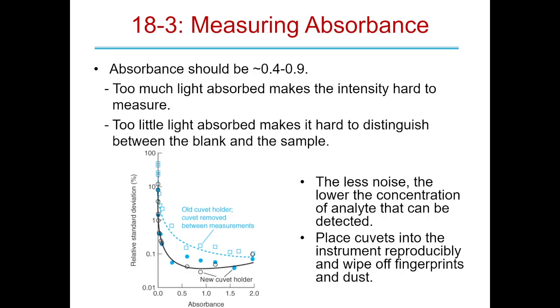Those things are just terrible spectrometers. Absolutely awful. If you were to take the same sample, you'll actually see a change in the 0.01 area or 0.008-ish area. And they'll bounce around, so that has a lot of noise.